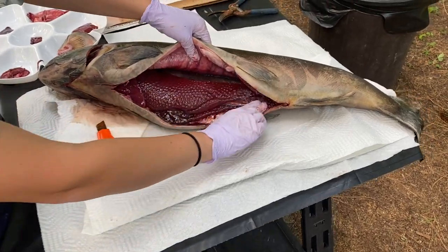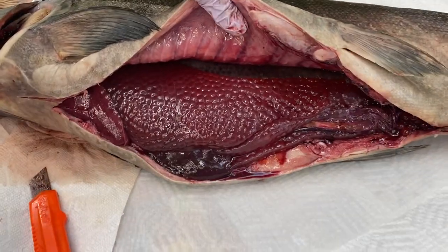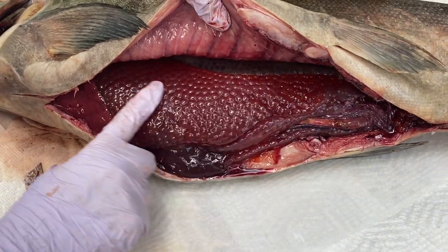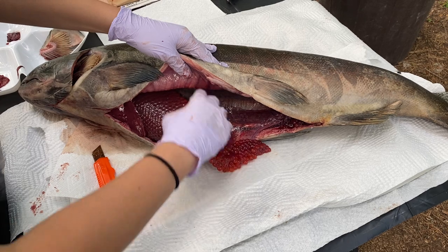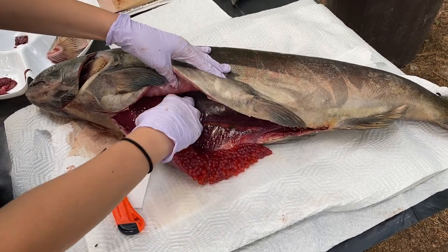Okay. So the male had 2 milt sacs. She has 2 egg sacs. And it's so rare that we could open these and they're still inside the sac. So this female had all of these eggs inside of her.